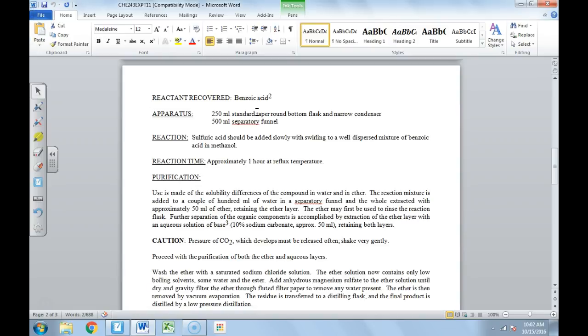Now, in my experience, I have found that this procedure isn't horribly long. It's only going to be 3, 4, 5, 6 sentences, where you're going to talk about how much of each of the reactants that you're going to deal with, and what specific sizes of the containers you're going to use. So it's not a whole hog, do it all on your own sort of thing.